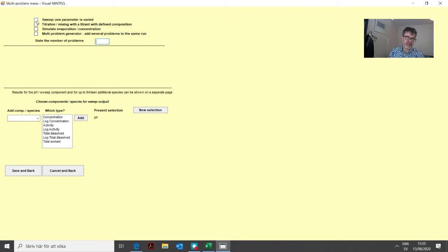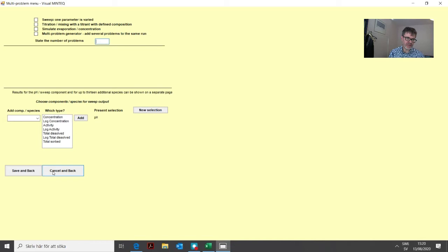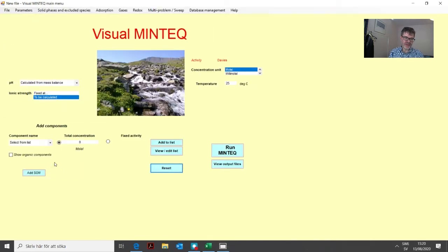We start with the sweep option. There's no point doing that now because before we start using these options, we should have something defined on the main menu. So we cancel this and go back.